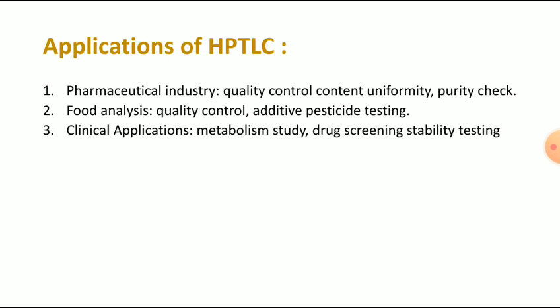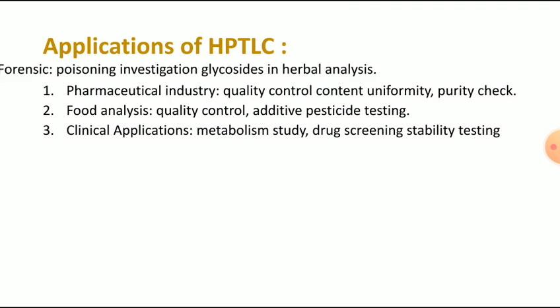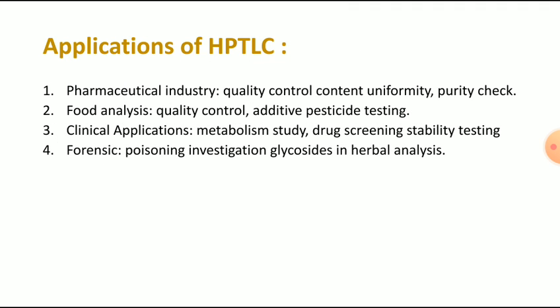Third one, clinical application. In these clinical applications, metabolism study, drug screening and stability testing will be done with the help of HPTLC. In the forensic lab, it will be used for investigation of poisoning, and of glycosides in herbal analysis. Fifth one, it is used in fingerprint analysis.